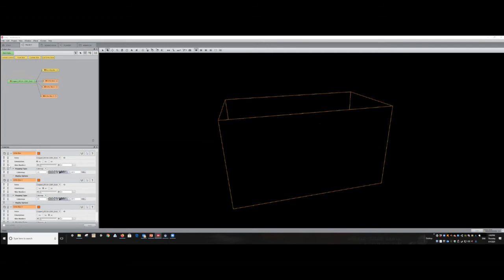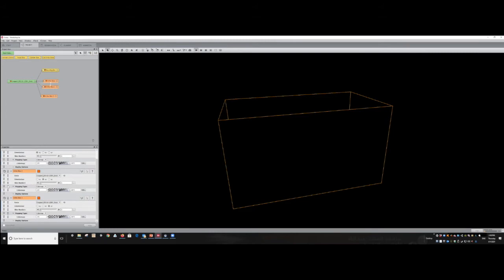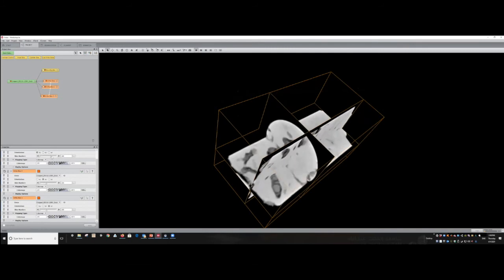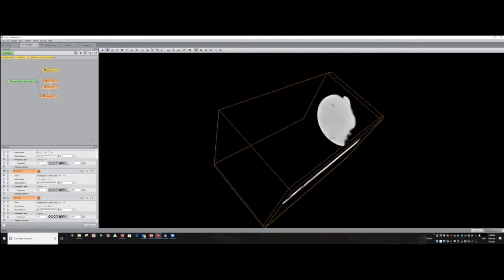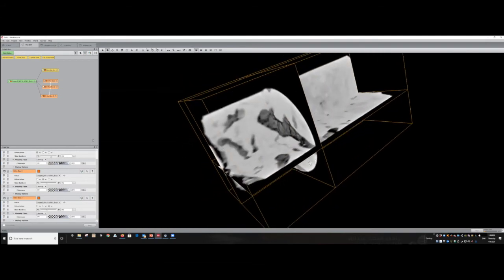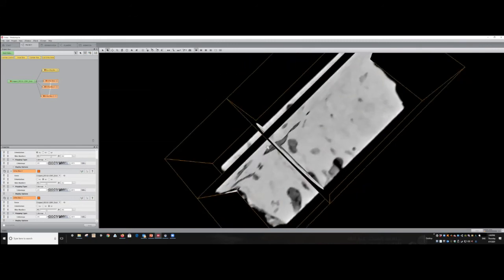Okay, and now, let's say I want to connect those ortho slices. I will click on the first slice number and drag it to the slice number of ortho slice 2, and then click on the second ortho slice number and drag it with the left mouse button and drop it on the slice number to connect those ortho slices together. And now if I move my slider, I'm actually moving them all together. As you can see here, you can find interesting parts of your data.